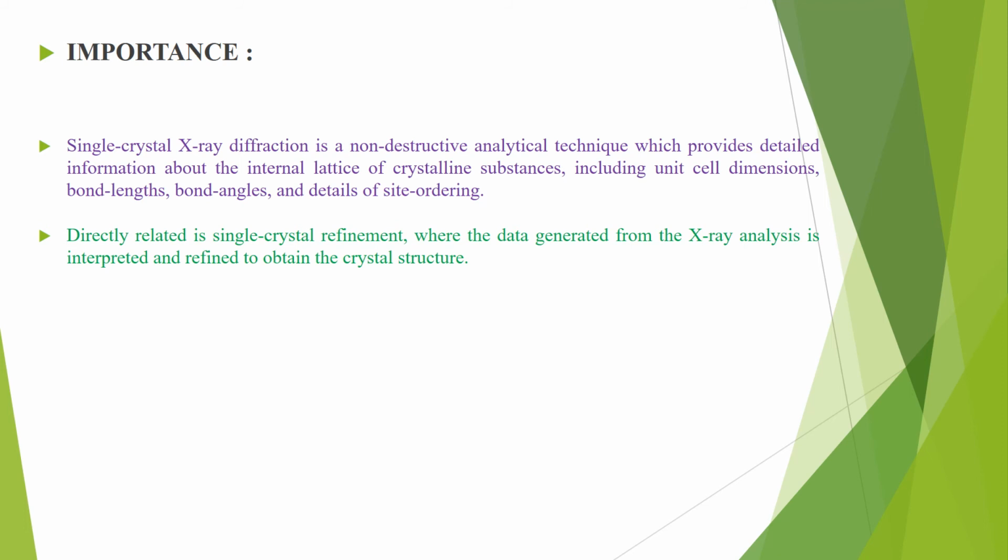Non-destructive technique means the sample we use to analyze in this technique is not destroyed, and this includes unit cell dimensions, bond length, bond angle, and details of the site ordering.